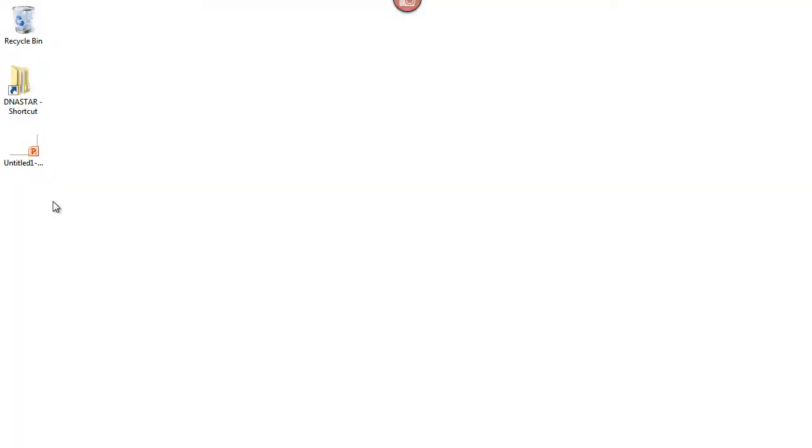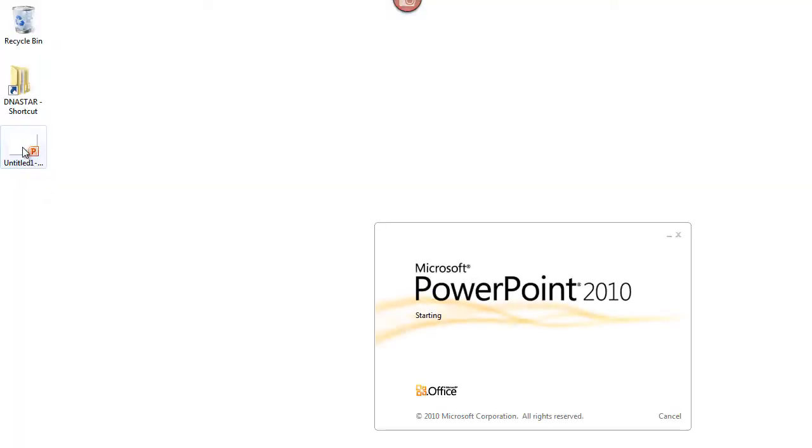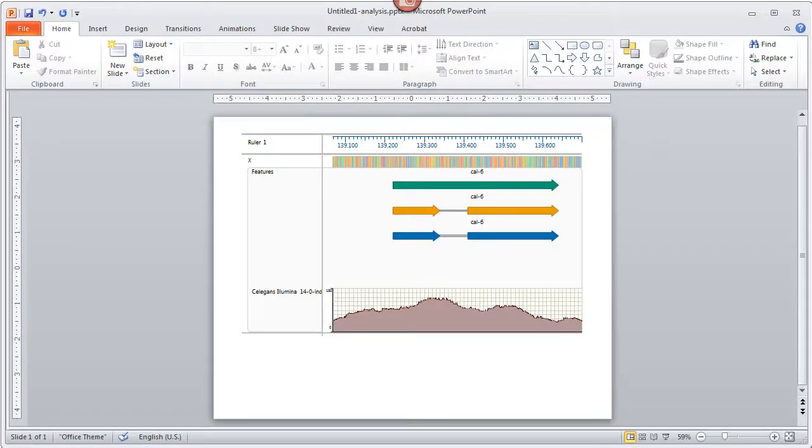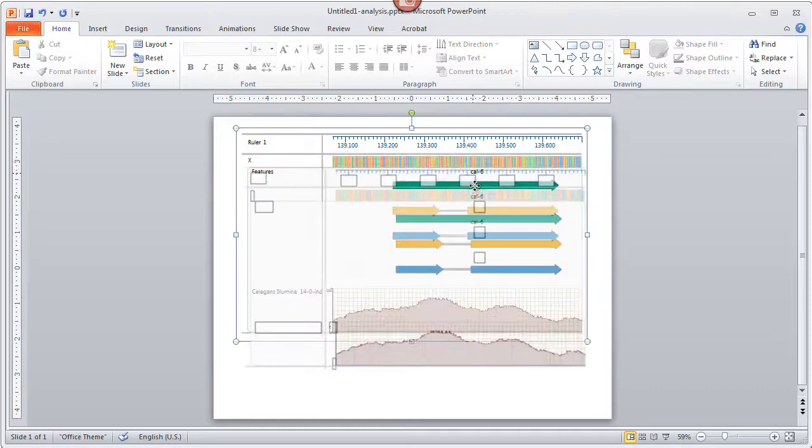So here's our exported image and I'll just double click on that to open it directly in PowerPoint. The image components are initially grouped, so I can drag the entire image to a more optimal part of the slide if I like.